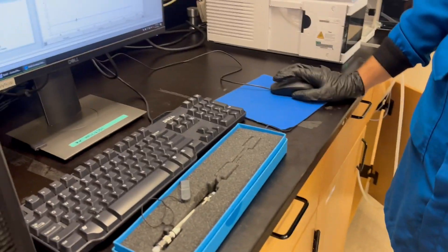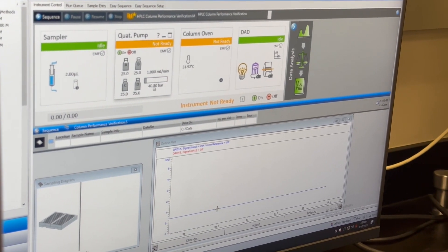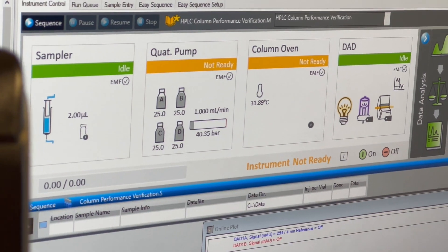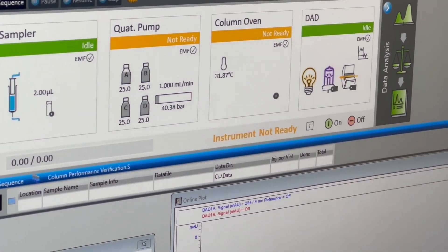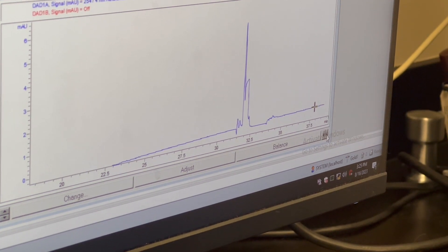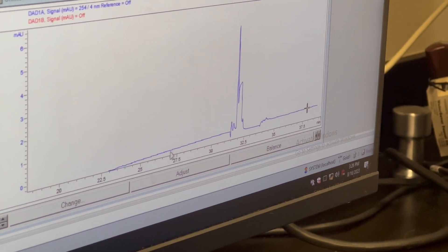We've been flowing our mobile phase through the system at various flow rates, but now we're at one ml per minute and we've reached a pretty stable pressure for our back pressure. Our detector has also gotten pretty flat. If we look at what has happened, we can see a lot of variation — that variation occurs every time you change your flow rates. You can see the ramping here, which is from the UV light turning on and coming to temperature.